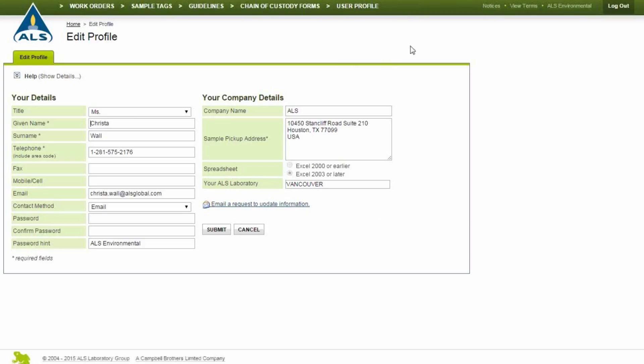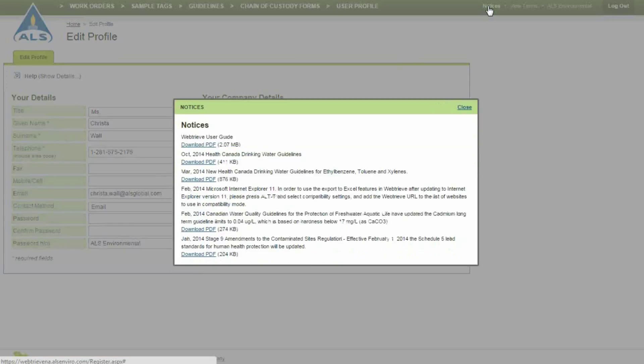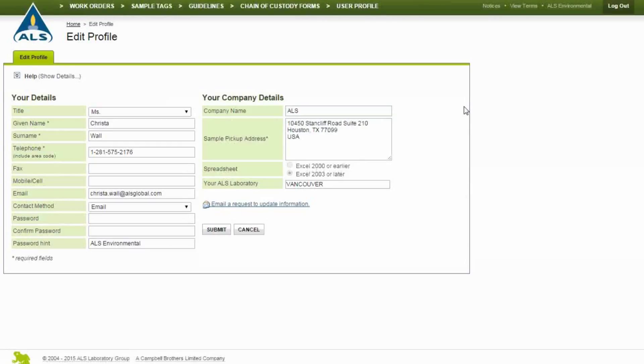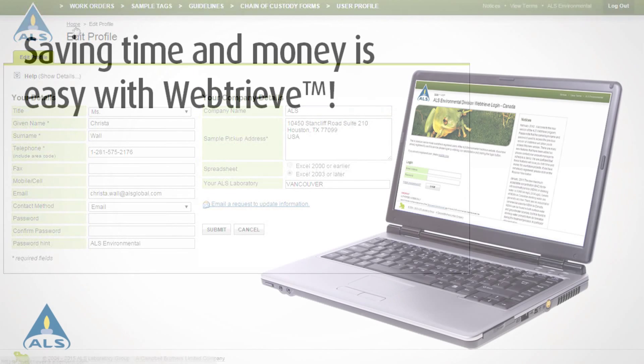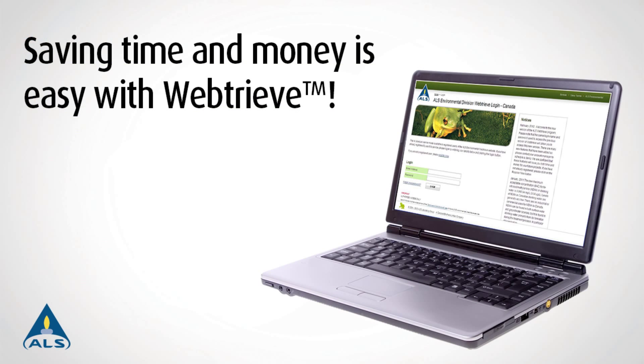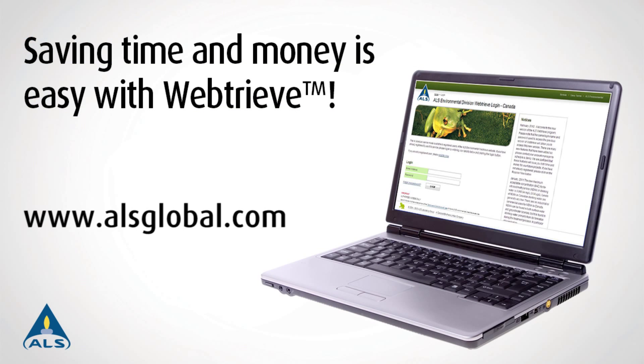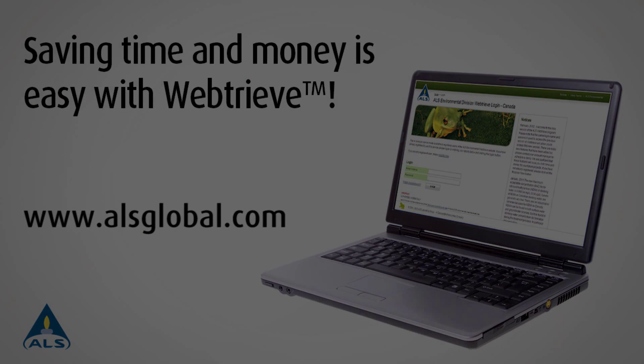Click Notices in the top links to view and download user guides and the latest documents for changing information when changes are made to regulatory limits. This feature is also available on the login page. For any additional information regarding WebTreeve, please visit www.alsglobal.com or contact your ALS Account Manager.